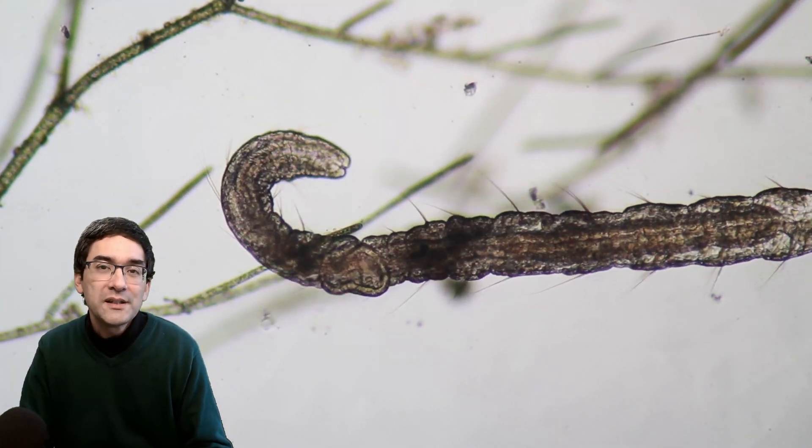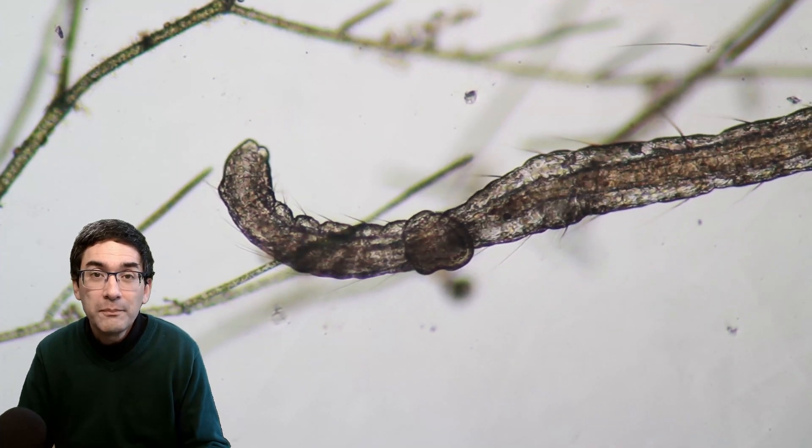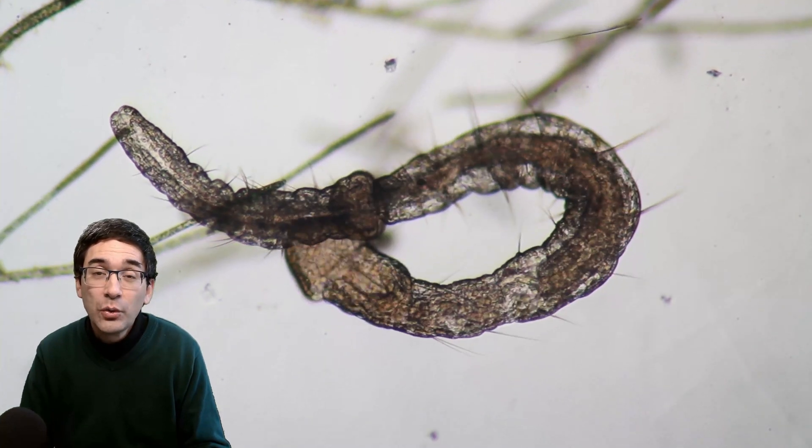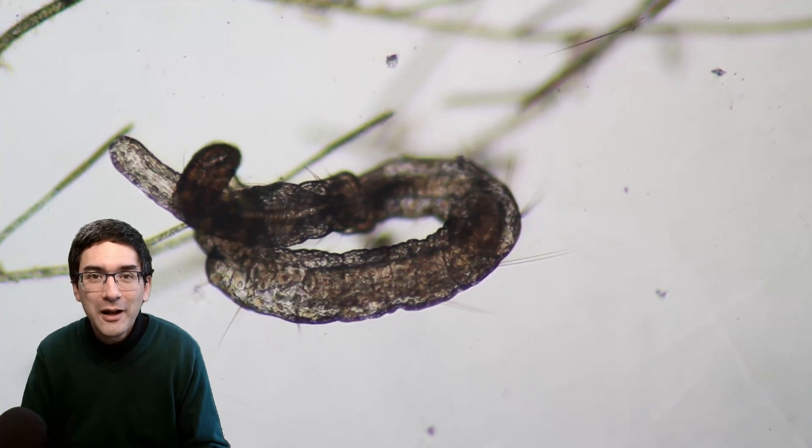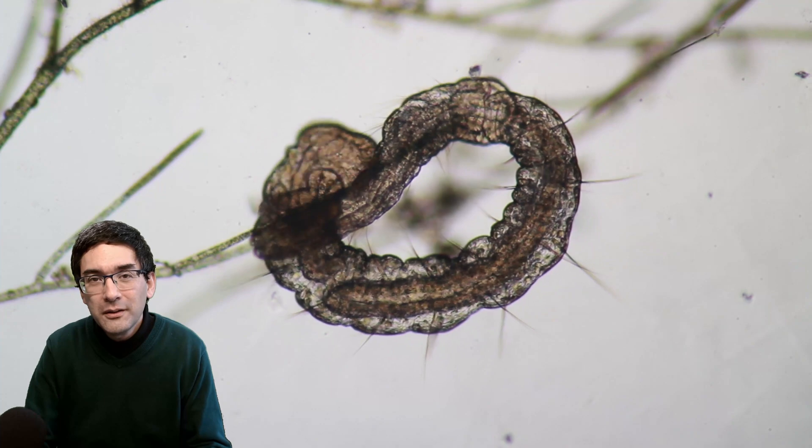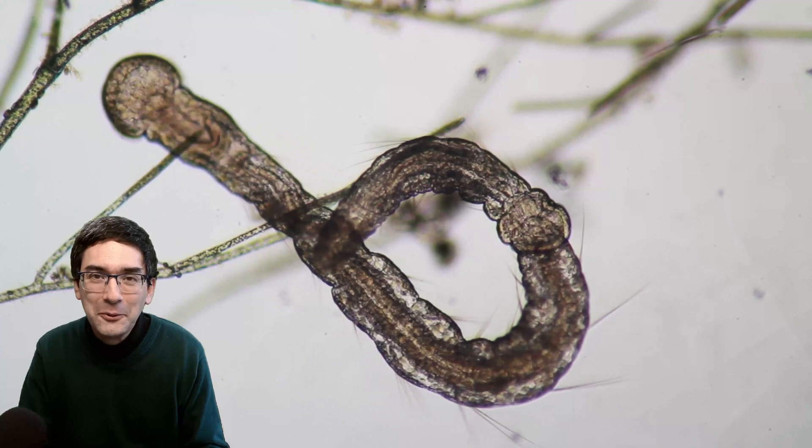When the worm has reached a certain size, it will grow a new head right in the middle, so the worm is actually going to divide in half and then you have two worms. In this way, it's able to reproduce quite quickly. That's basically what it likes to do.